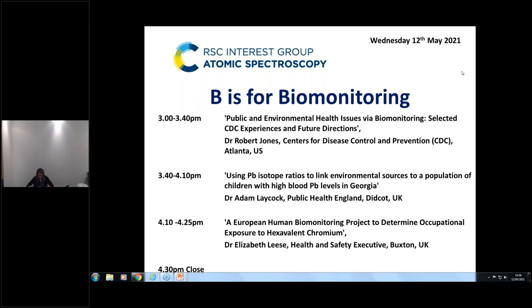These programs involve research and development of a wide range of analytical methods to enable the Centers for Disease Control and Prevention to assay and monitor the exposure of populations to toxic or essential elemental exposures and radionuclide contamination. These analytical methods include both total elemental analysis as well as the speciation of arsenic and mercury. His responsibilities also include the implementation and laboratory aspects of multiple local, state, regional, national, and international health studies or investigations. Dr. Jones will today talk to us about his experiences in research, which is entitled Public and Environmental Health Issues via Biomonitoring, Selected CDC Experiences and Future Directions.